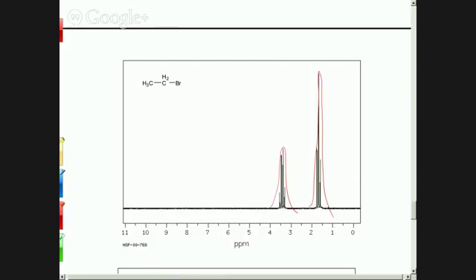Okay, so let's put all that together. What does that mean? This peak has 4 splits to it. It's a quartet, which tells us that this particular group, whatever that corresponds to, has 3 neighboring hydrogens. So it's not a group of 3, but that group has 3 next to it. And why was that again? Because it's split into 4 peaks. It's a quartet. And we always split into one more than the number of the neighbors. And the other one's 2. So this one, whatever this one is going to be, has 2. That doesn't mean they're attached to it, it means they're attached to whatever's adjacent to it. Right. Yeah.